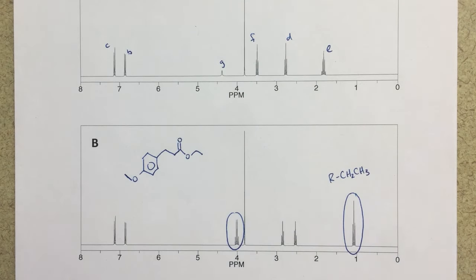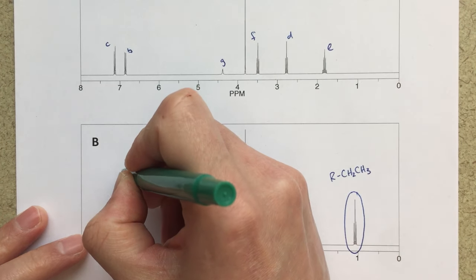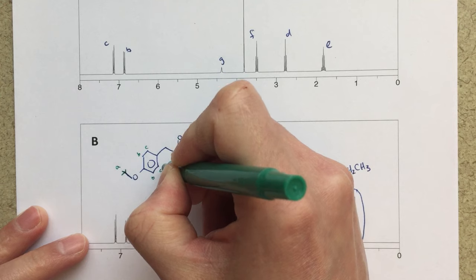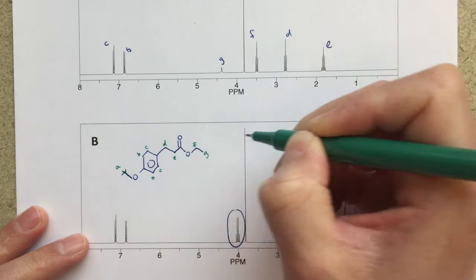So the next thing I would do is go through and label all of my peaks in C, sort of, if it makes sense. So we'll call this group here A, we'll call these B, C, D, E, F, and G.